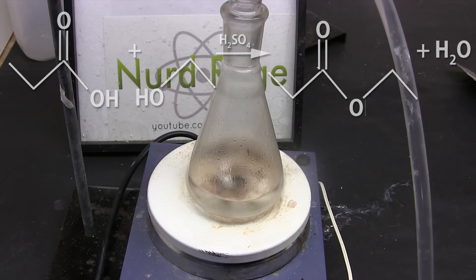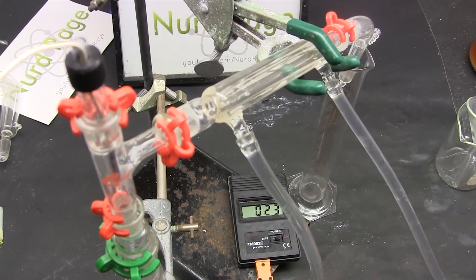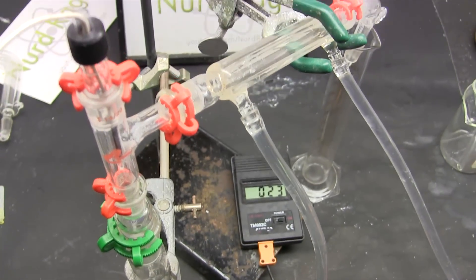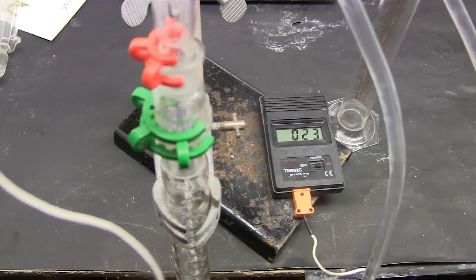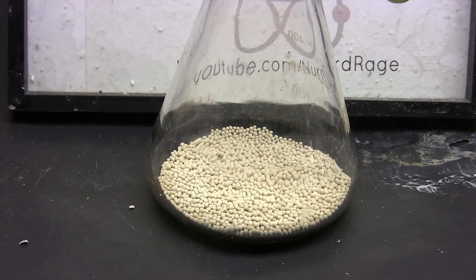If we could remove the water we could drive the reaction forward. Unfortunately we can't just distill the water out because the ethanol and ethyl propionate azeotropes have even lower boiling points — we'd never be able to selectively remove just the water. We'd also carry out too much of our reactants and stop the reaction.